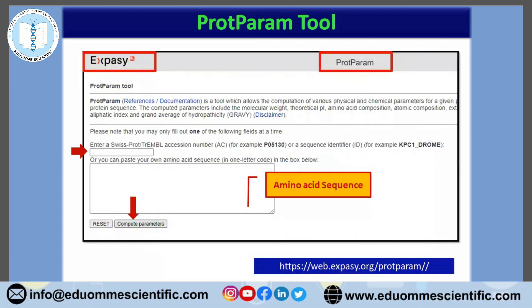So this is the ProtParam tool. This is a part of ExPASy. From ExPASy, we have to go to ProtParam. You can use this URL to come to this platform.